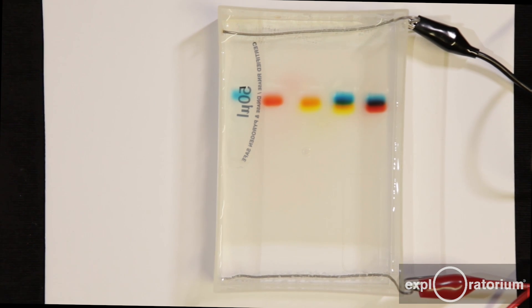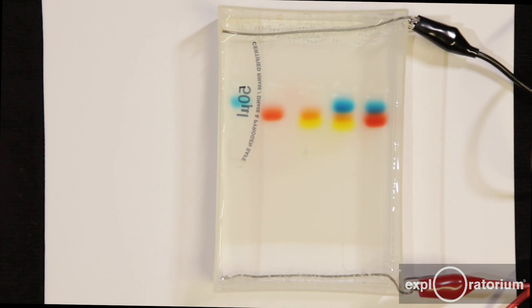These five dye samples have been loaded into a gel and are under an electric current. What do you notice about how they move? This process is called jello electrophoresis. Find out how to do it yourself.